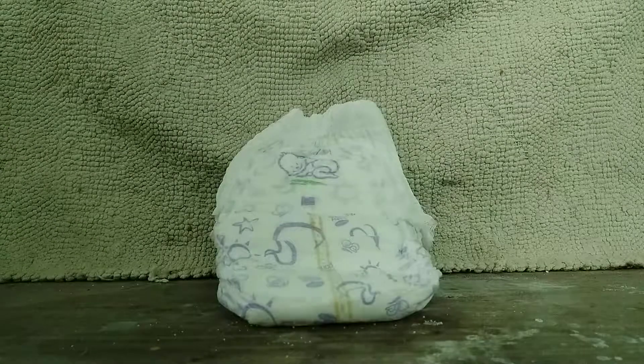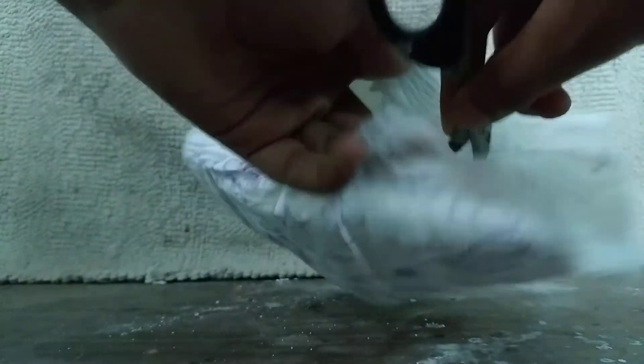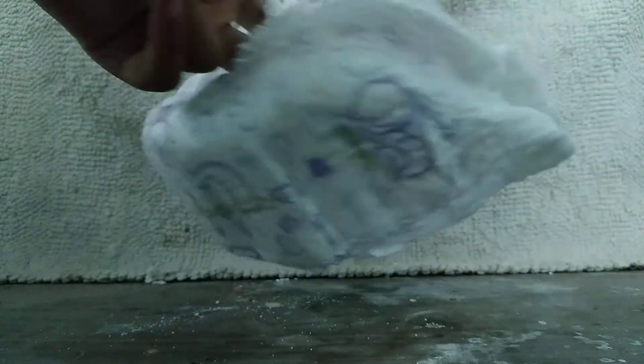So let's get on to how to remove the sodium polyacrylate from the diaper. The first step is to take some scissors and then cut this diaper's side from here so that we can get down to the bottom portion.